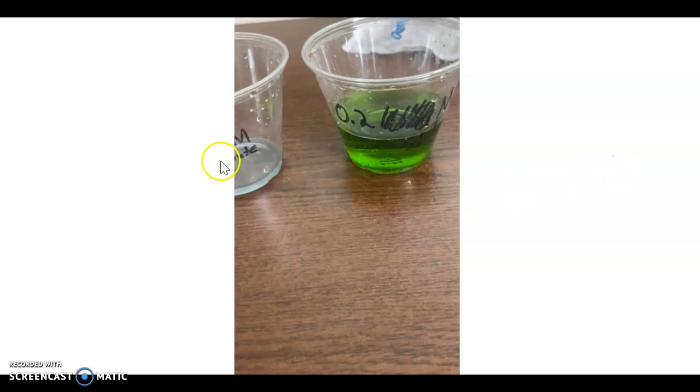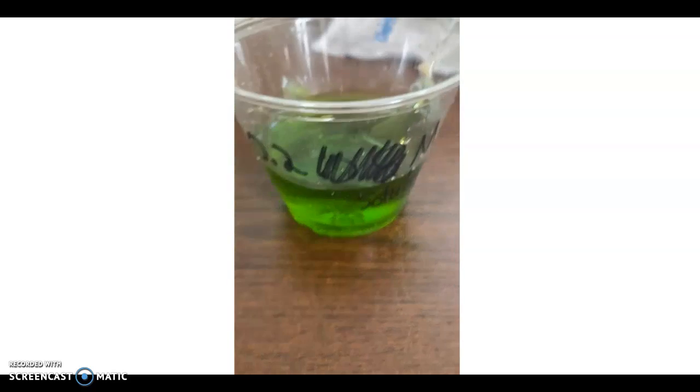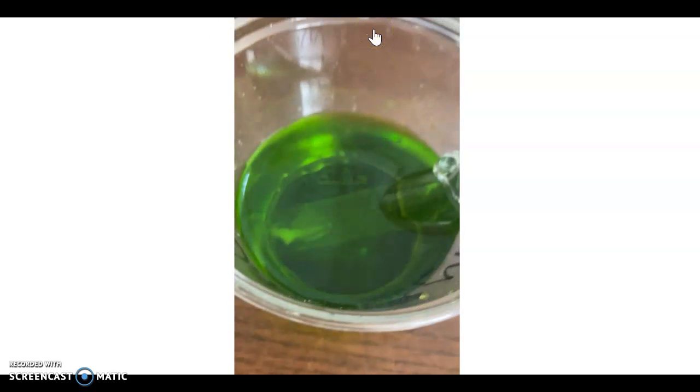So go ahead and write 15.04 or 15.05 grams in your data table on that first box. After taking the mass, groups went back to their tables, and all they did was put their dialysis bag in the exterior solution and wait for 25 minutes for the osmosis to actually occur. They set this up, and then they proceeded to work on their pre-lab questions from the first page of that handout.